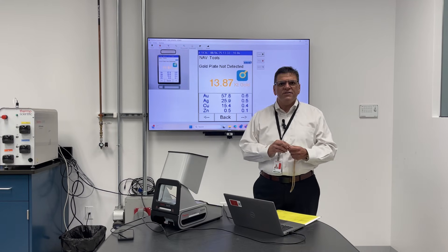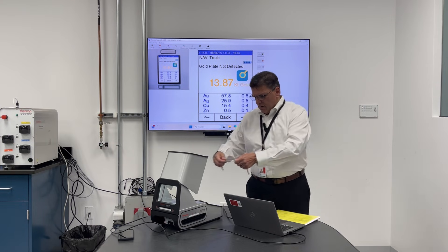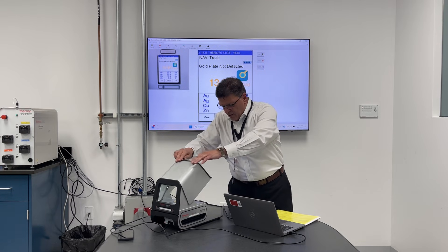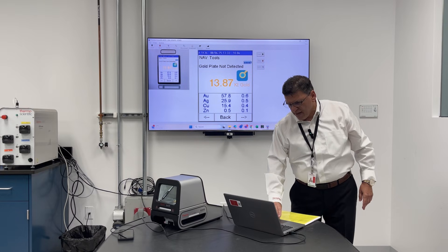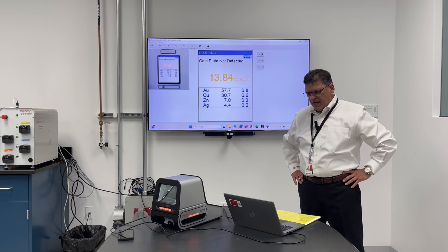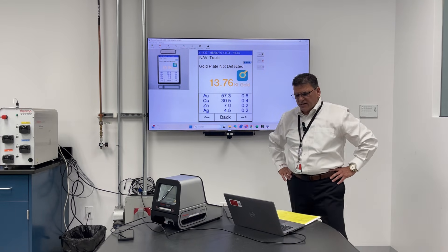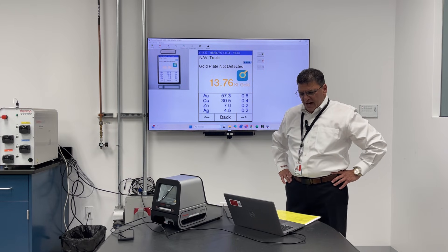So what are we trying to do? In essence, authenticate people's jewelry. This is a Cuban link chain with no known carat value. This would have been weighed, and going through the analysis exactly the same as the reference standard, you can see it's 14 carat — a blend of plus or minus 0.6 to reach the 58.5% required for gold, along with copper, zinc, and silver.